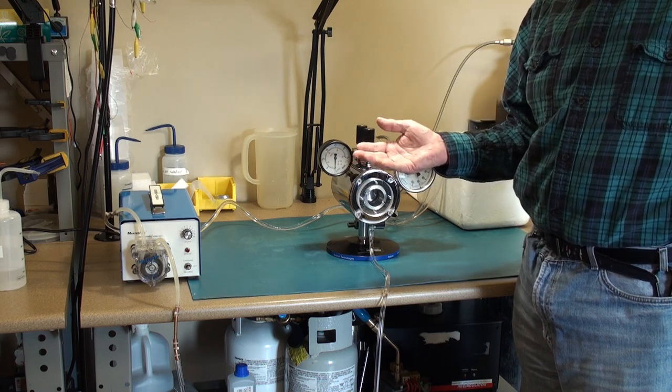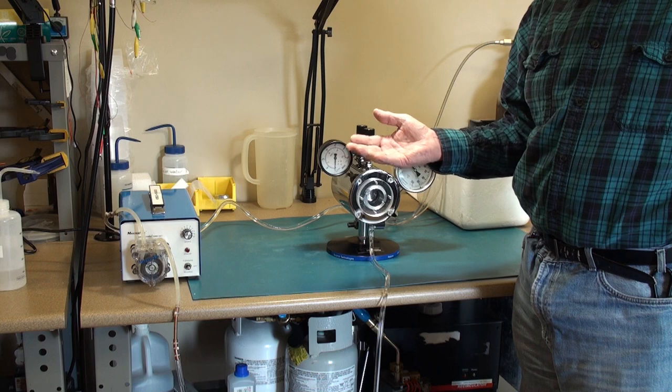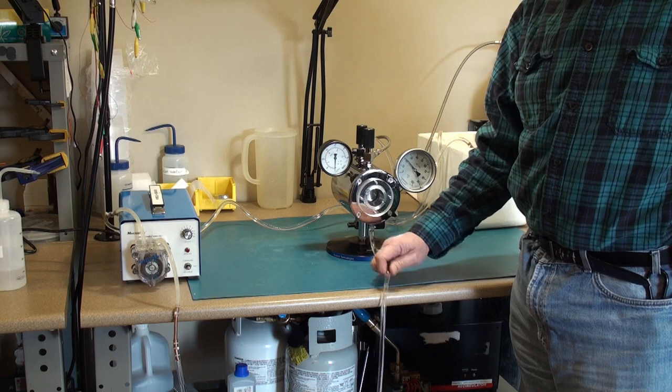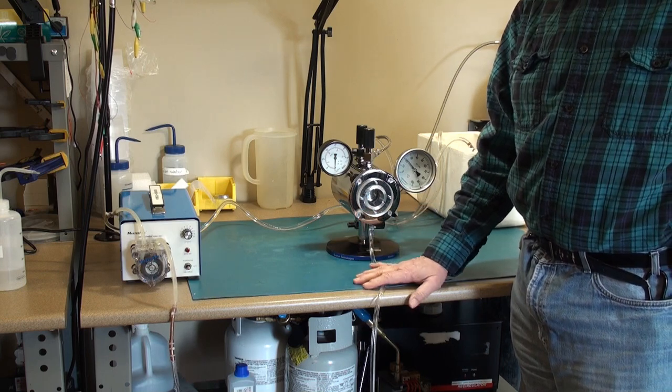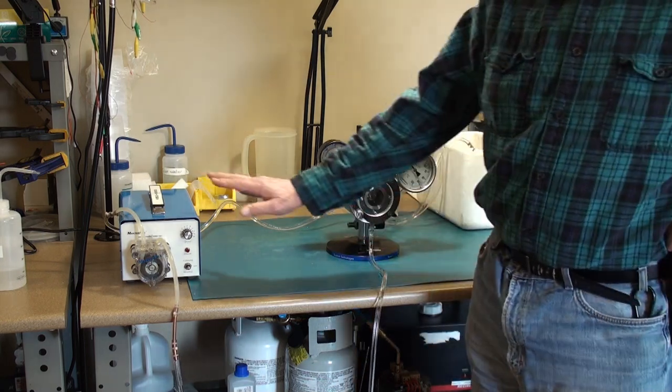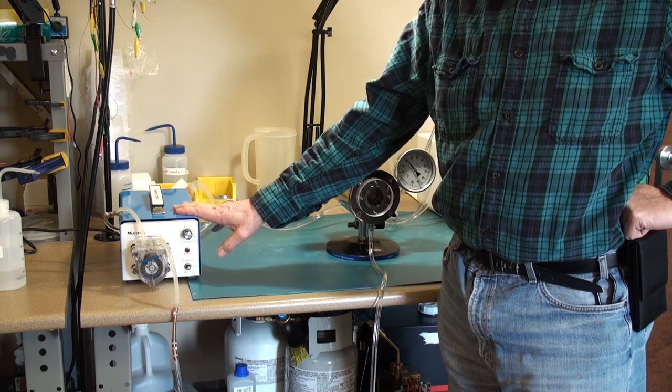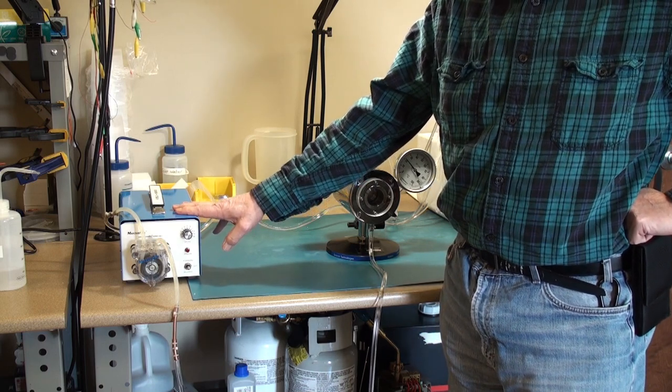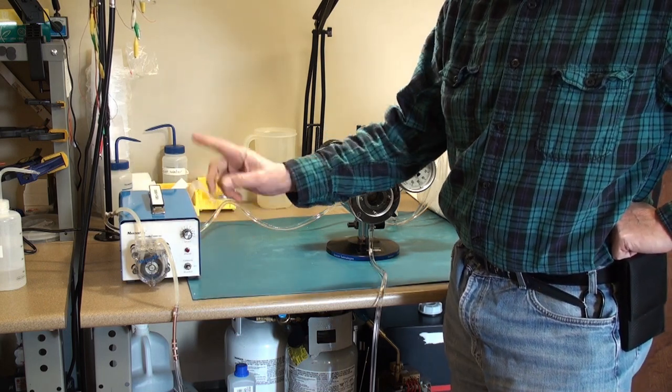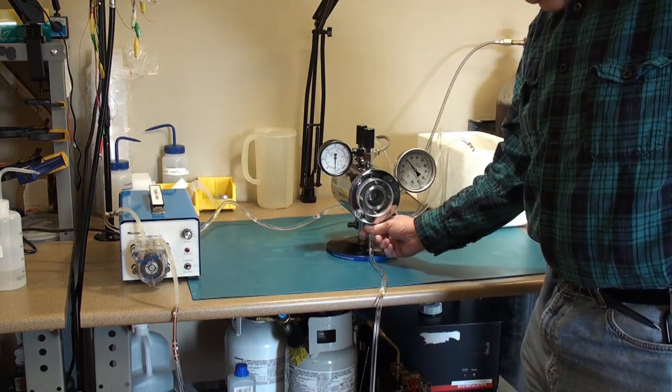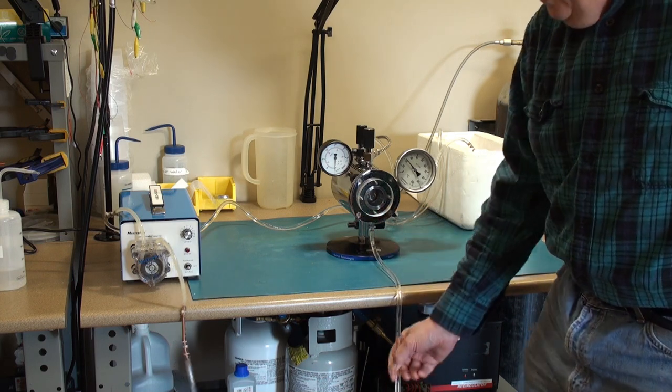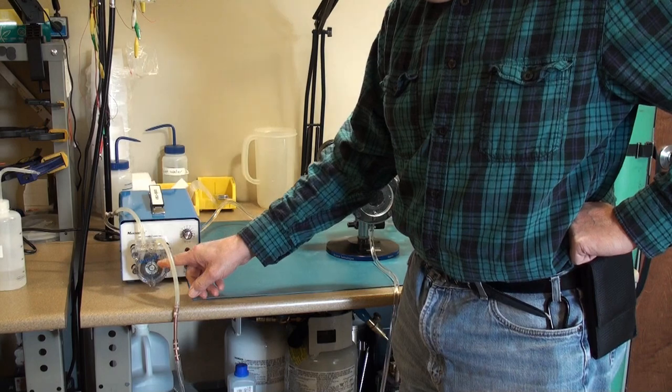Or even lower if I use something like antifreeze or ethylene glycol as a circulating cooling media. Here I'm just using water that's in all these tubes. I have a used recirculator pump, a peristaltic pump that I got off of eBay. It serves the purpose quite well to circulate the fluid.